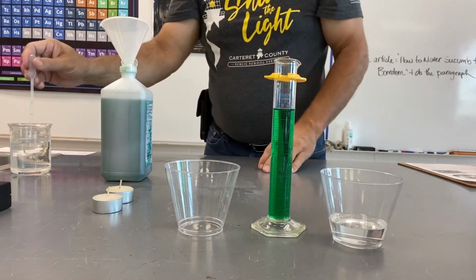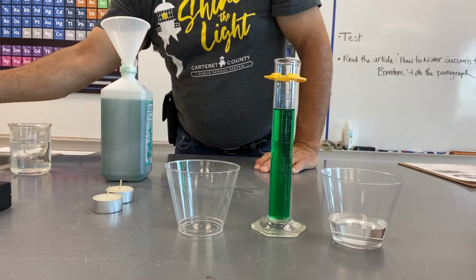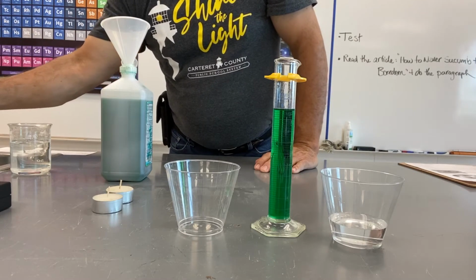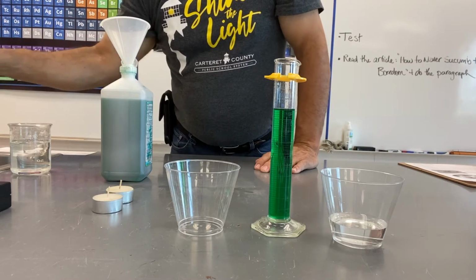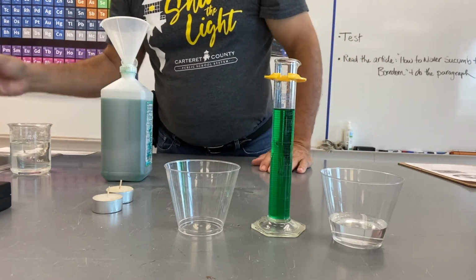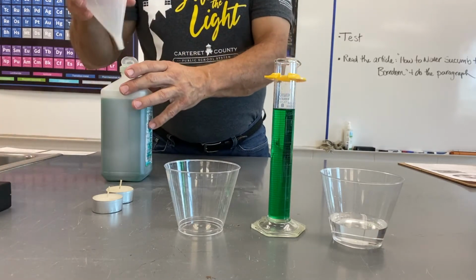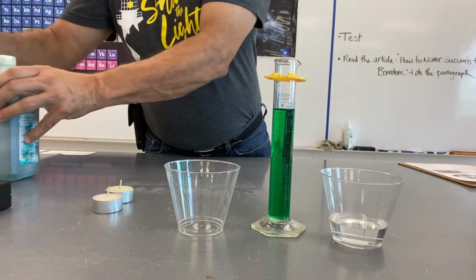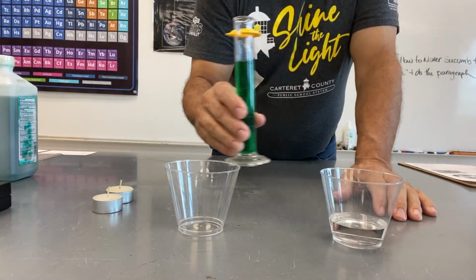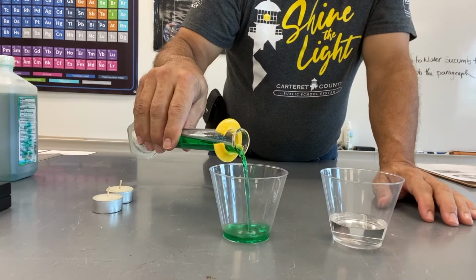Clear the pipette. I'll have to rinse that with some water here. That's right into the sink to get all the alcohol out of it. Now alcohol would just evaporate, but it's green colored alcohol, so I don't want the pipette to be all green, so that's why I'm making sure I wash it all out. All right, close that up. And now I have 50 milliliters of rubbing alcohol.